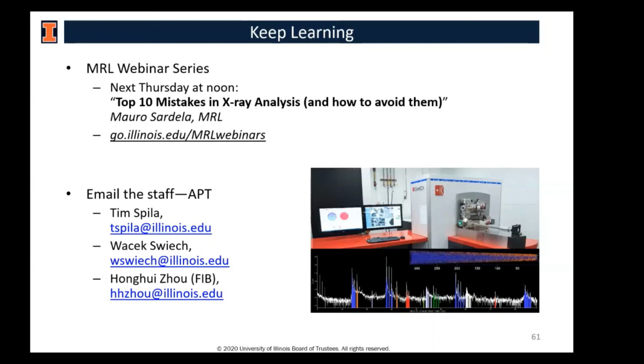Oh, yeah, you're right. The only thing I would like to add is, as Wojciech mentioned earlier, doing microscopy on your samples can be very useful. And so that's one of the nice things of our FIB instruments. It's very easy to get some nice starting images of your sample. And it is even possible with a little bit of work to do TEM on samples as well.